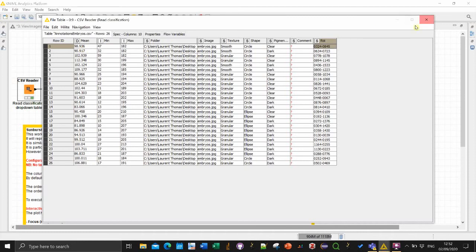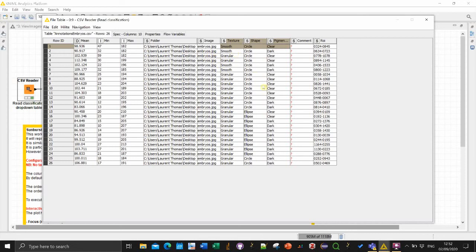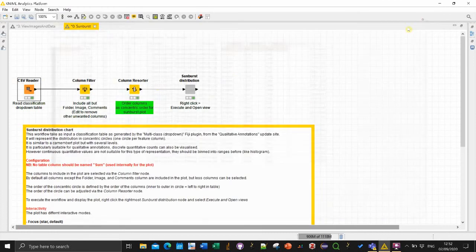But actually in this case I will just focus on those for this sunburst plot because it's only qualitative information that we want to know. So basically in this population of embryo we want to see a bit how much of them are granular, smooth, circular or more elliptical, stuff like this. So reveal the distribution.